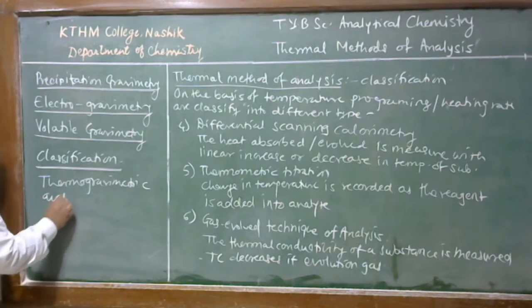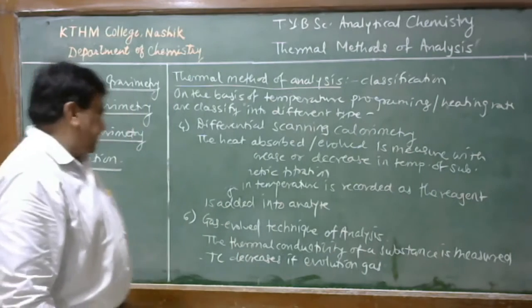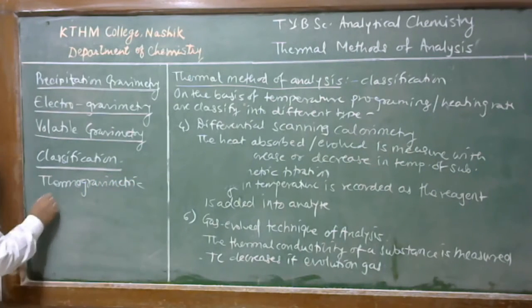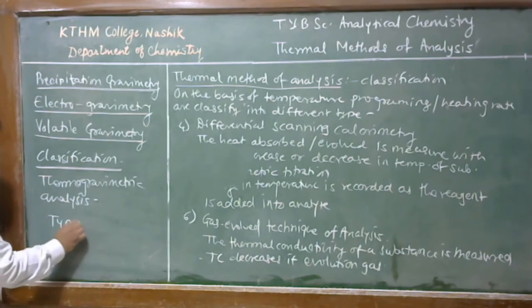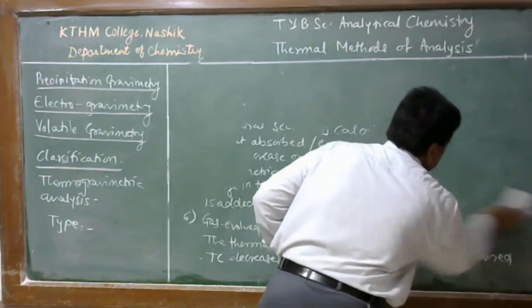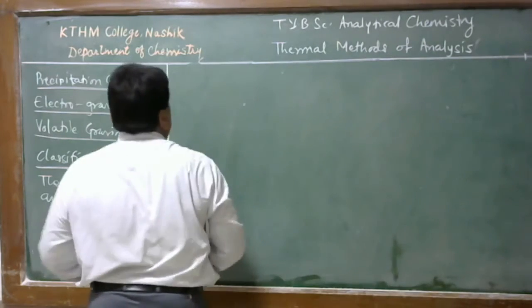Thermogravimetric analysis. Student, now we discuss the thermogravimetric analysis and its types. Thermogravimetric analysis is again one of the most important methods of thermal analysis. Now in this case, there are 3 basic types of this thermogravimetric analysis.